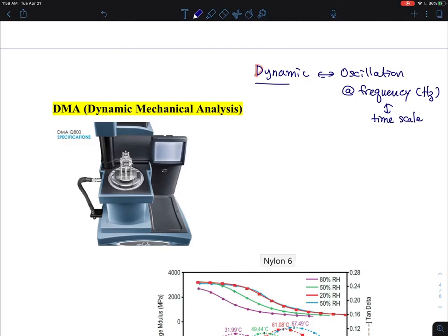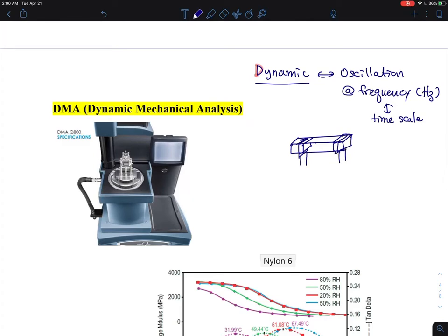Essentially you oscillate a sample — a typical example is bending. You put your sample here, clamp it with a stationary clamping bar, and there is another one called a probing bar connected to a motor, which goes up and down.